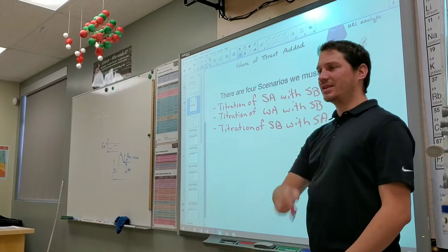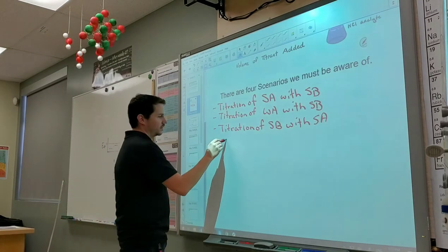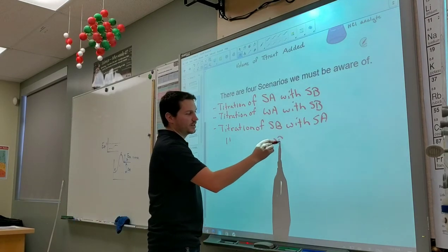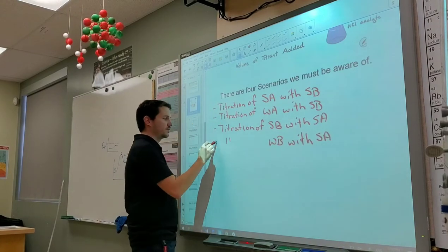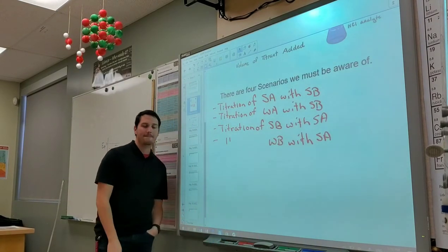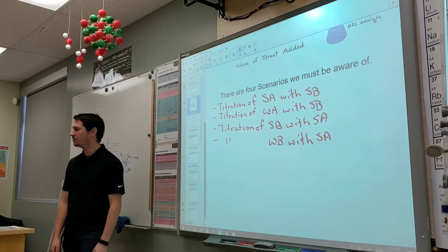And what's the last thing? A weak base with a strong acid, yeah. Titration of a weak base with strong acid. I put quotation marks because I'm sick and tired of writing titration.